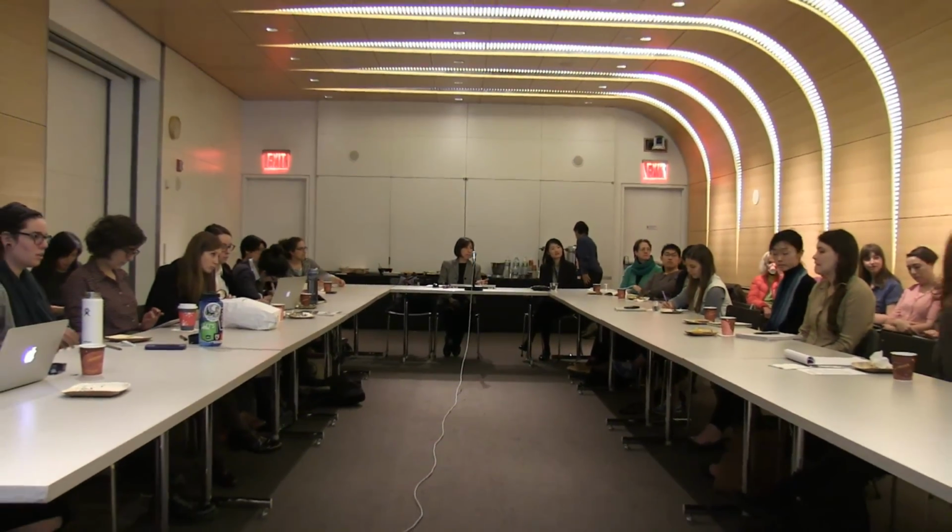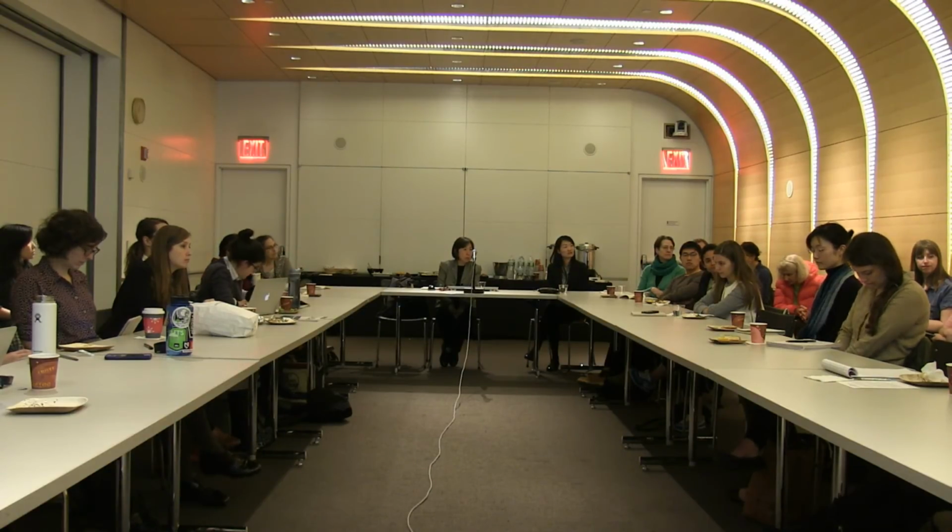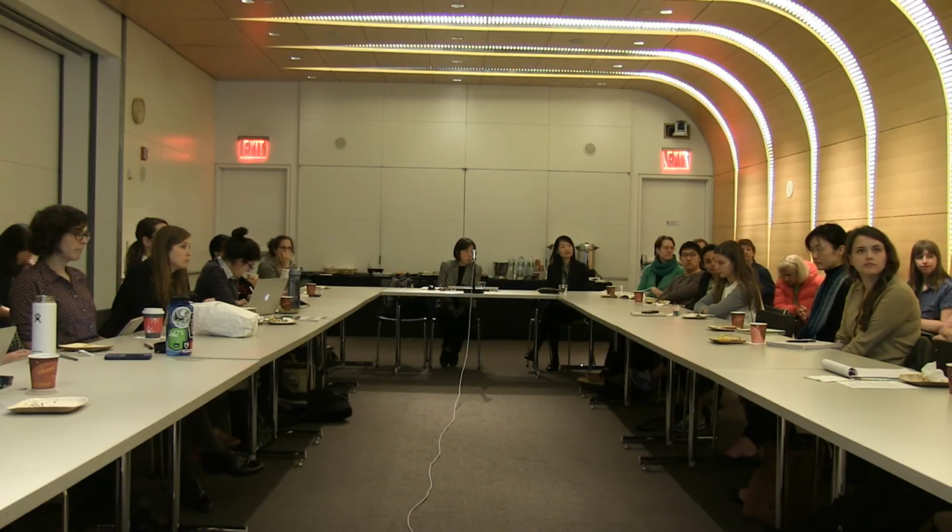Thank you very much for this wonderful talk. I have one question. In the case of the cochineal that you discussed, is there any possibility that what you detect to be cochineal was added after the time, was not part of the original dye, but was a result of the textile being, after it was made, in the vicinity of, let's say, a box full of these insects? To what extent is the specific origin of the cochineal absolutely certain that it relates to the moment of the dyeing, and not something that was added after by means of nature or time? Yeah, it's always possible, like it could be restoration yarn.